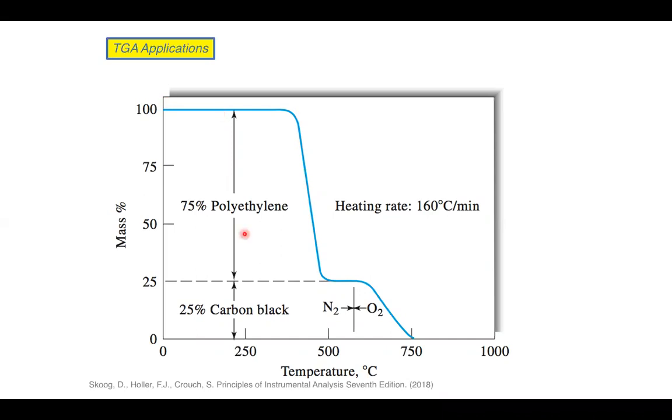This can be, as I've said before, the breakdown of the polymer chains and then the formation of the monomer units. That will cause a sharp decrease in the mass as those monomer units tend to be much more volatile. They're ethylene units. Ethylene is usually a gas, so those will mostly vaporize. We'll also vaporize any alkanes or hydrogen gas and things like that, which will evaporate off and leave us behind a kind of charry black residue. This will be the carbon black, literally just carbon.